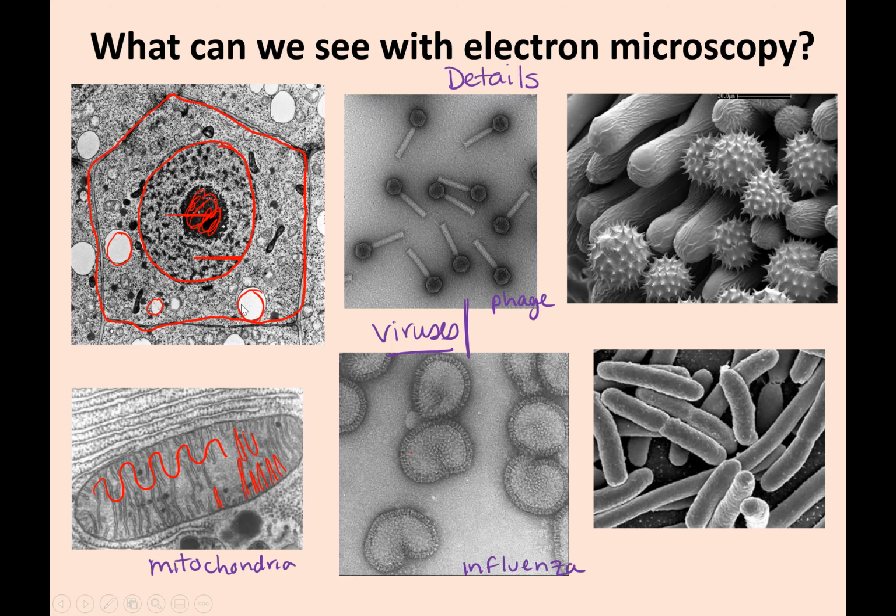These two on the left-hand side are what we call transmission electron microscopy, so these are TEM images.